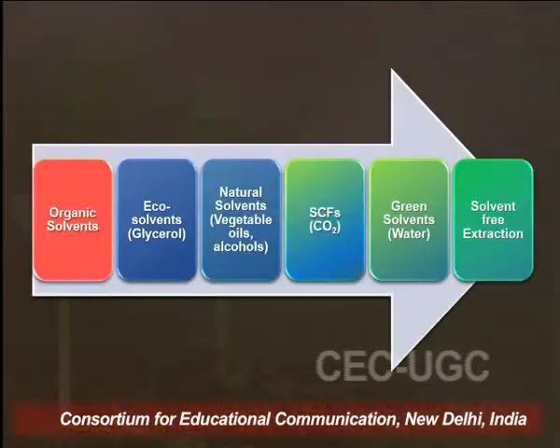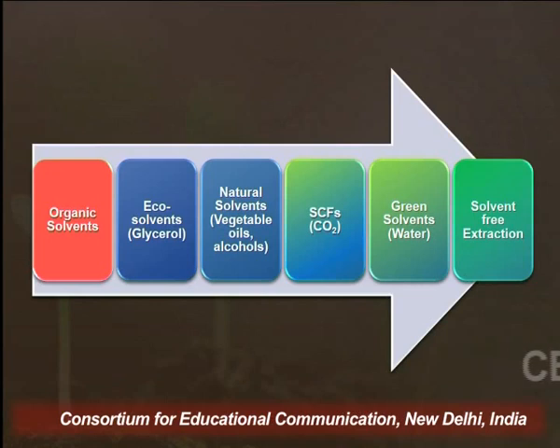Now before I further dwell into PSE, or pressurized solvent extraction technique, I would just like to focus on this figure, which shows the development, or the change in the approach of solvent selection in different extraction techniques. In yesteryears, or rather at present also, we use organic solvents, which are considered not environment friendly, because there are certain side effects of these organic solvents and a lot of energy is required in order to evaporate them when we want to concentrate our extract.